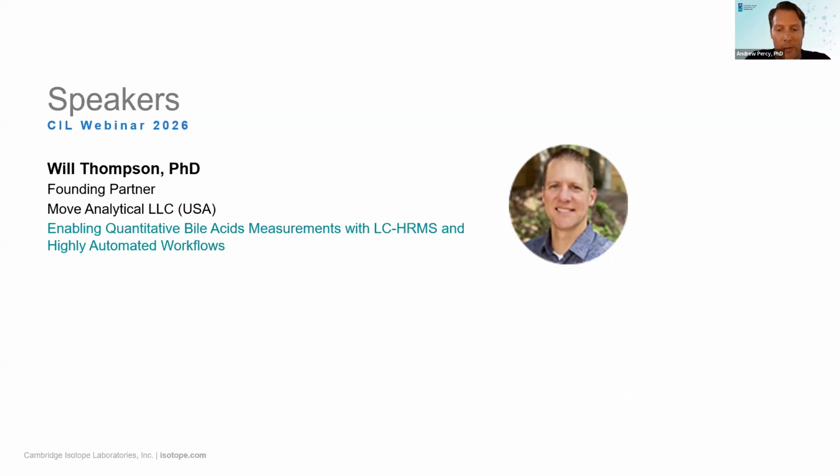This included his time at the Duke Proteomics and Metabolomics facility as an associate director and research faculty, as well as in his roles later as a principal scientist in R&D and director of life science business development at 908 Devices. Today, he's going to present the results of a new quantitative bile acid assay featuring the incorporation of a 32-plex bile acid standards mix, HRAM data acquisition, and a novel software workflow.